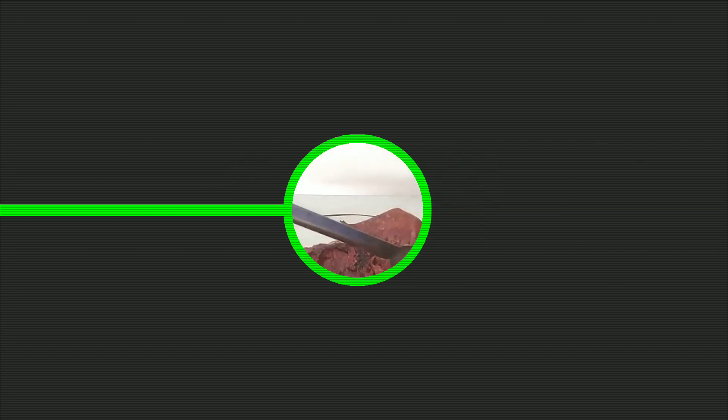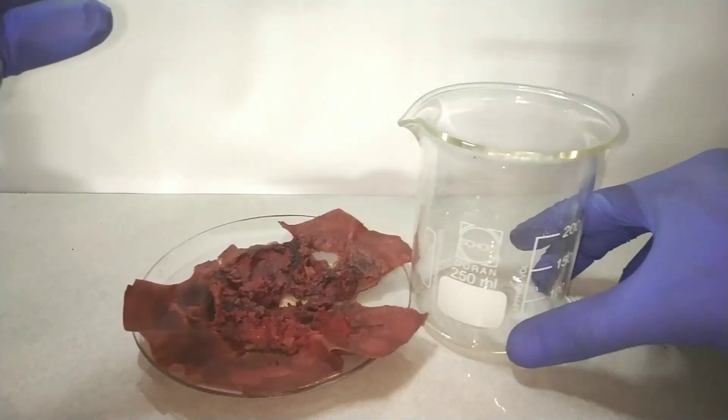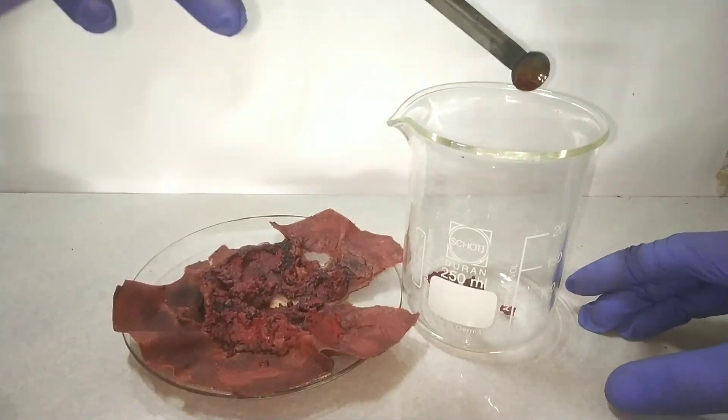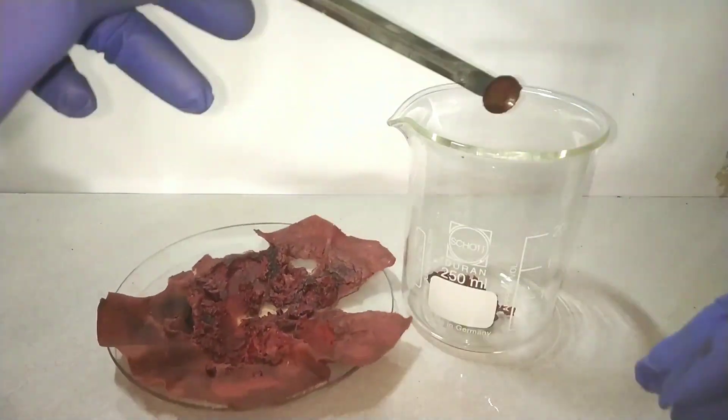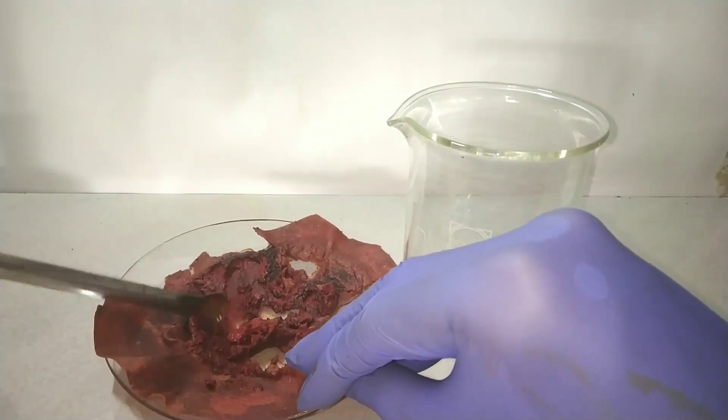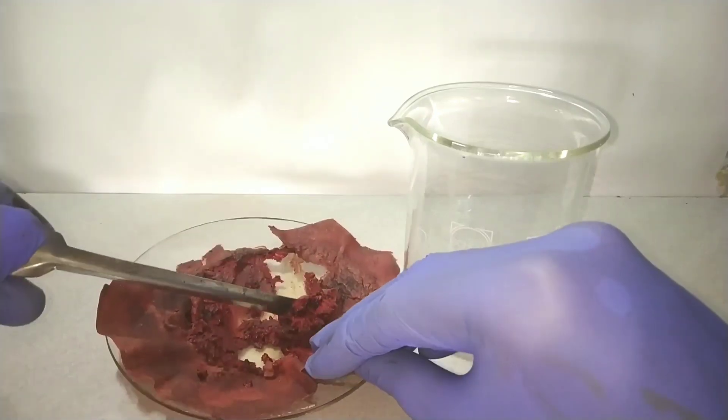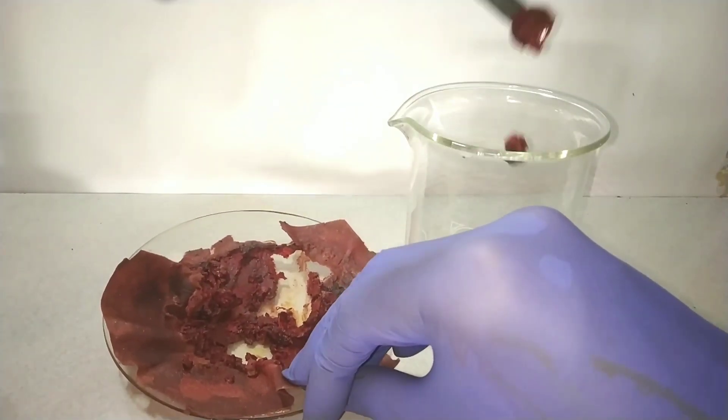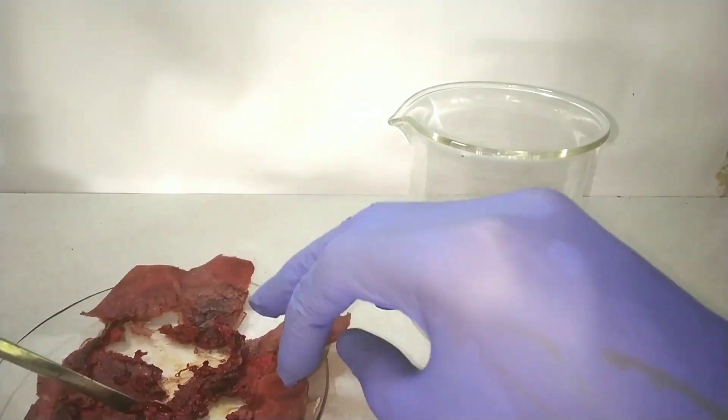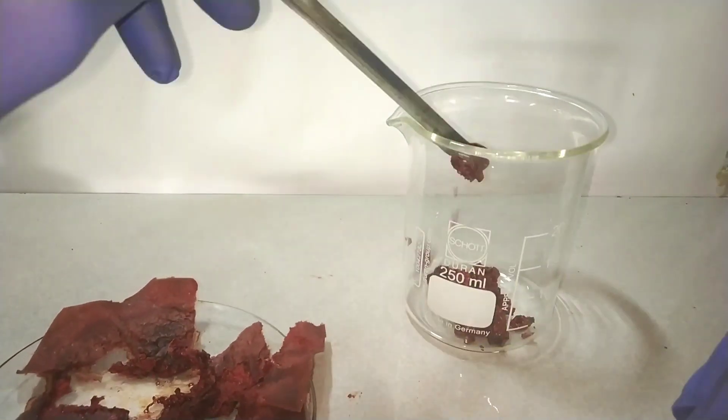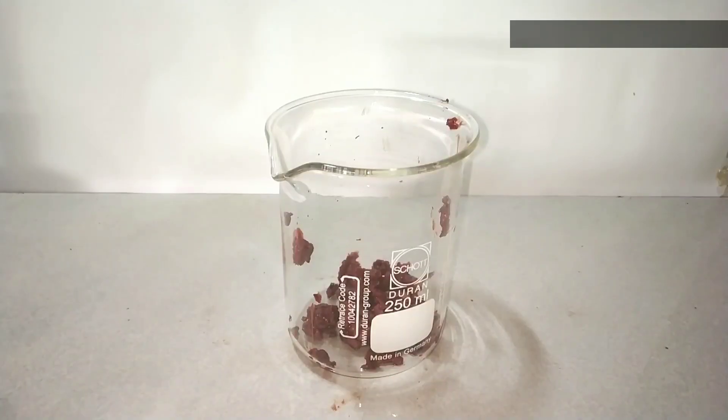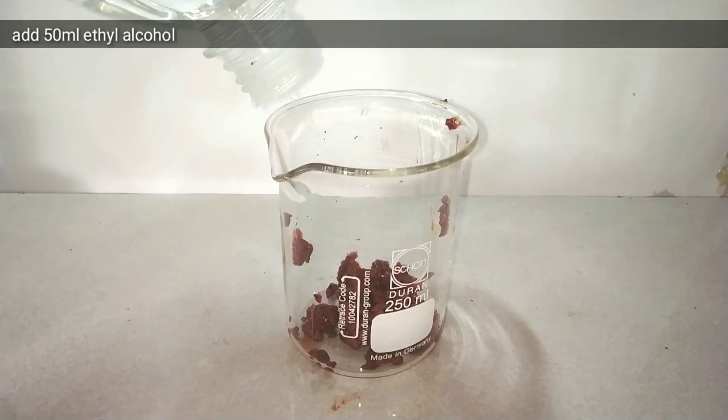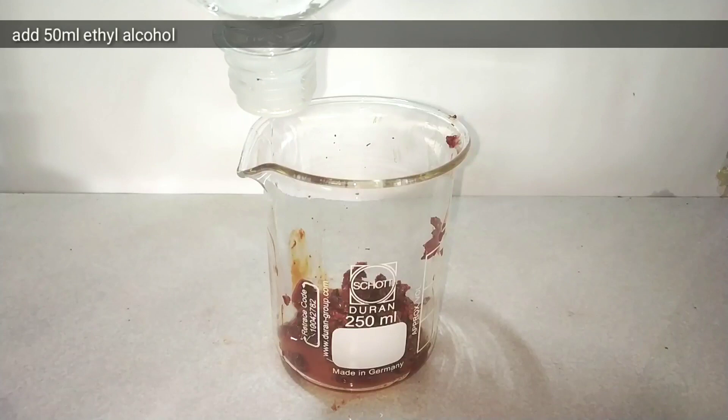After filtration I dried the crude product and now I am going to transfer this crude product into this 250 ml beaker on my right side. During this transfer you can see some filter paper bits are also being transferred into the beaker. But that is not a problem because in the next step I will be washing this with ethanol and the product will get dissolved in ethanol while the paper will not get dissolved in it.